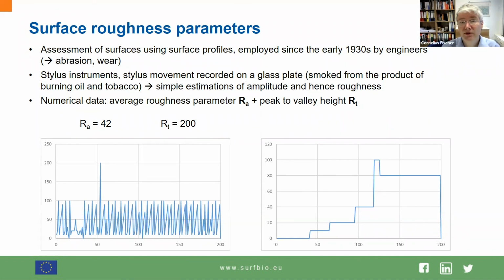Then you're going to analyze the second topography, and the topography profile looks like that. And maybe some of you are pretty tired because it's time to have a nap. I could ask the question, what do you think about the average roughness parameter, RA, left side versus right side? Is it higher or lower? What's your best guess? Does this topography look more rough compared to the right side? As always, the answer to the difficult question is again 42.